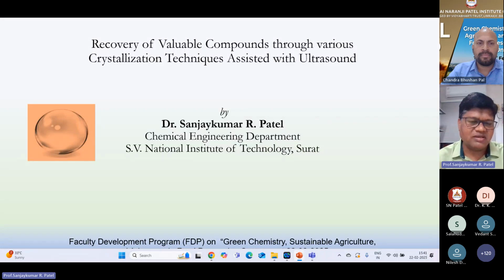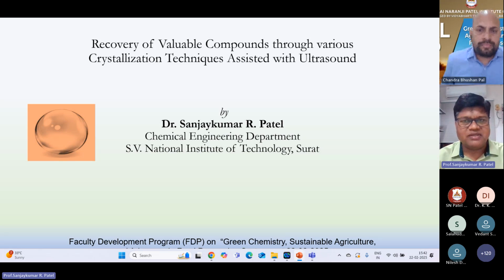First, I'll focus a little bit on crystallization, what exactly the crystallization process is, how it is being used, and what are the problems associated with crystallization. And then how to overcome those problems with various processes or by coupling particularly the sound wave technology, you can say the cavitation technology.